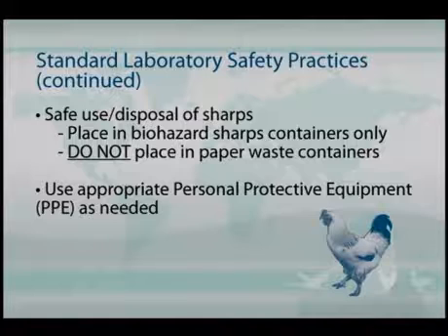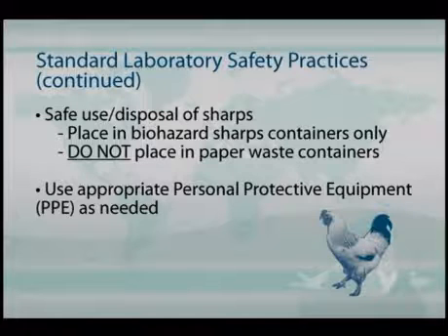So please make sure that the sharps are placed only in the sharps containers. And then, of course, depending on the activities that you're involved with will require the appropriate use of personal protective equipment, and we'll discuss that here briefly.